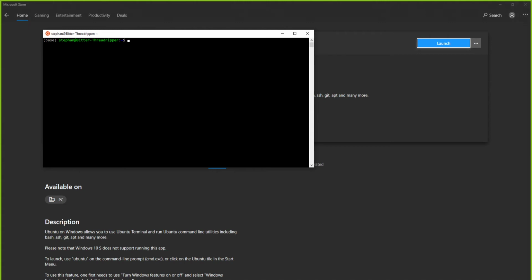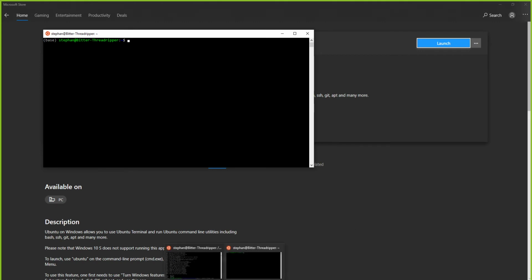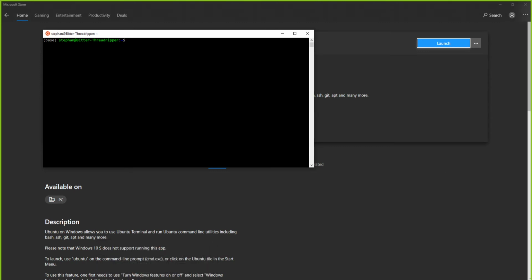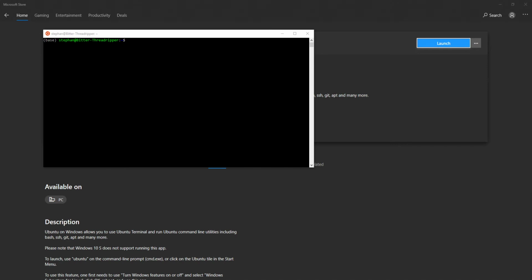Anyway, wget is an issue for some people on Macs. Yeah, here's QIIME's documentation. I'm going to stop sharing my screen, so you're going to have to copy paste these into your terminal. So I'll stop sharing.